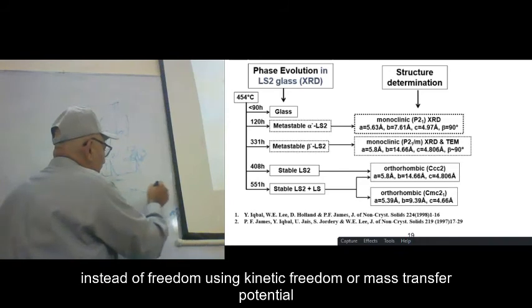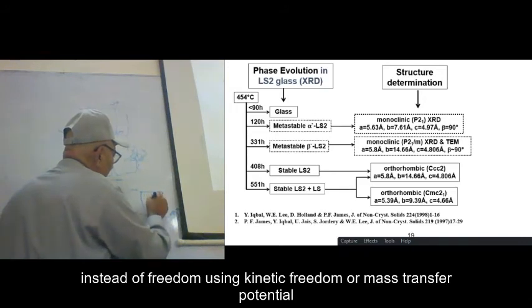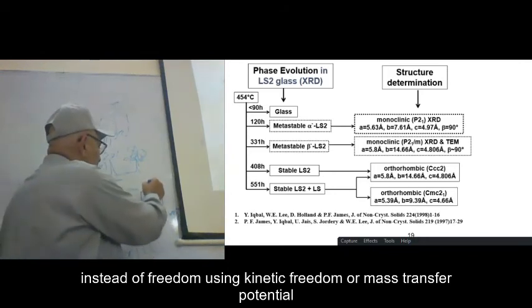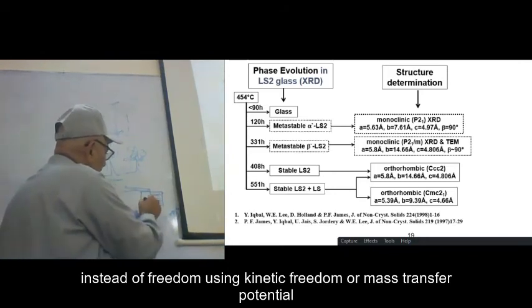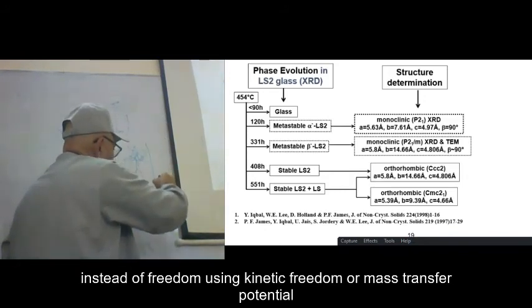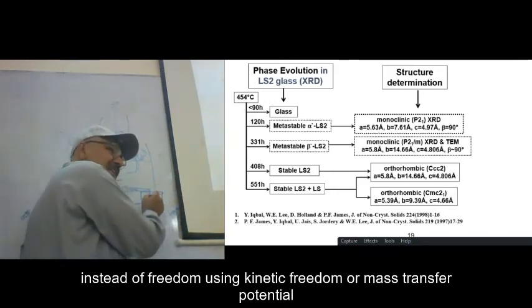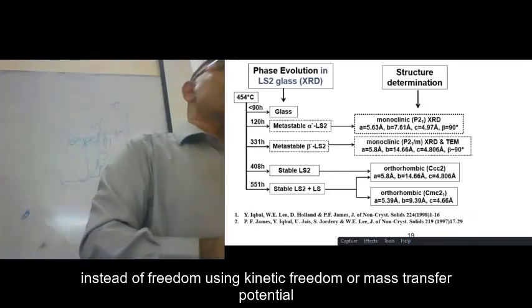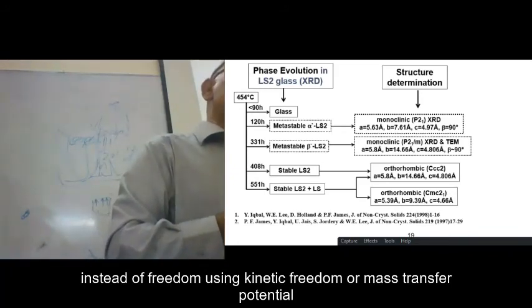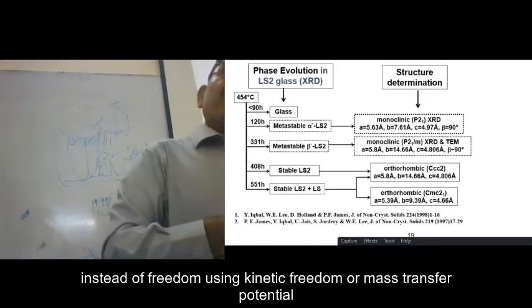How does the XRD look? This is a dip in the sample holder. This part goes into the grip of the sample holder where you put the machine. The X-ray radiations are coming here and they are diffracted in different directions. So if I fill this place with powder and finely smoothen the surface, I am giving every plane of the crystal equal opportunity to be scanned by the X-ray beam.